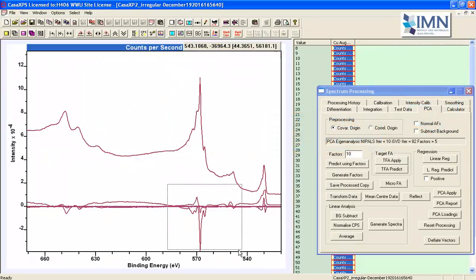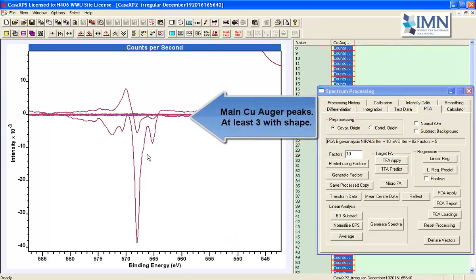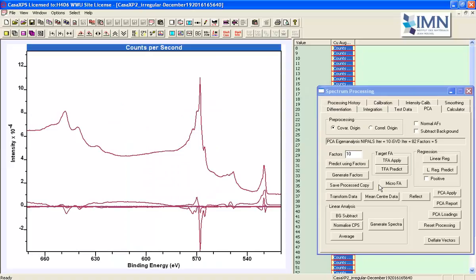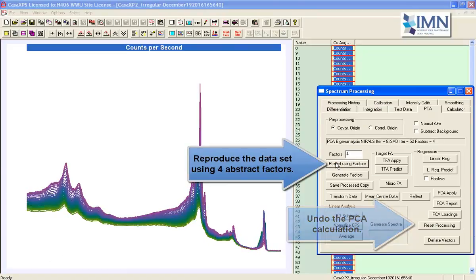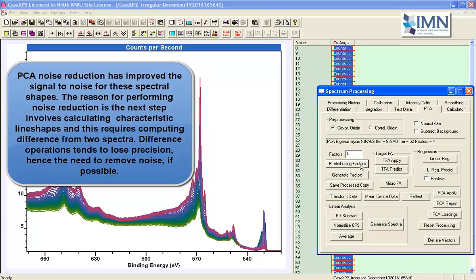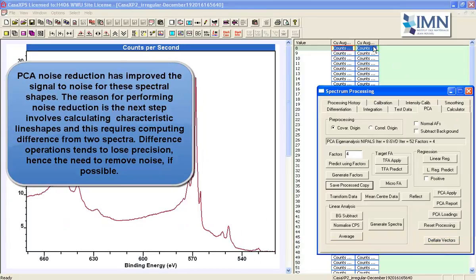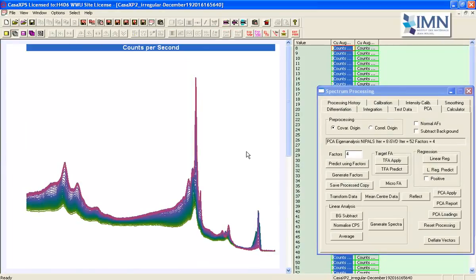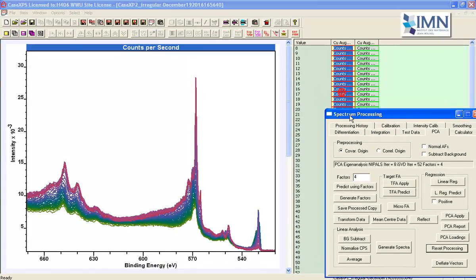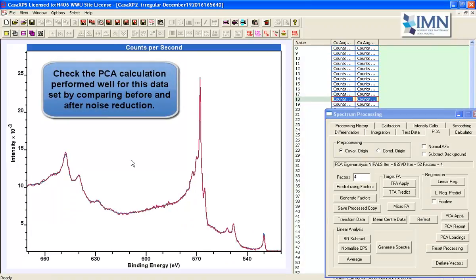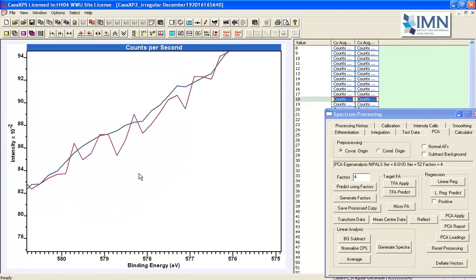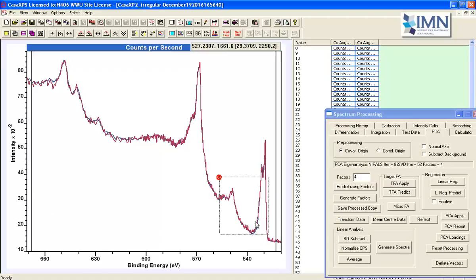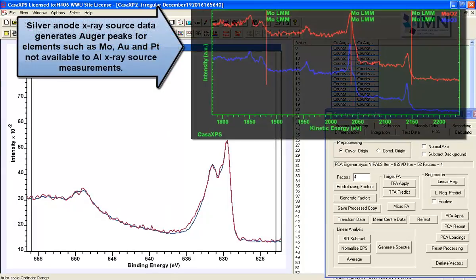We've performed a principal component analysis to see how many abstract factors can be generated from these data. We can see there are between three and four abstract factors that might be significant to these Auger lines. The fourth is probably related to the oxygen peak, where there's more going on in the copper(II) oxide — nitrogen and carbon also — so the oxygen peak is more involved. Using this PCA analysis we can do a noise reduction step, reproducing using four abstract factors.